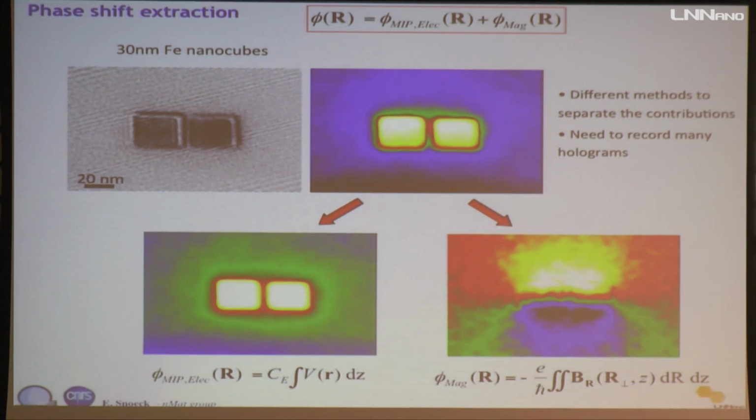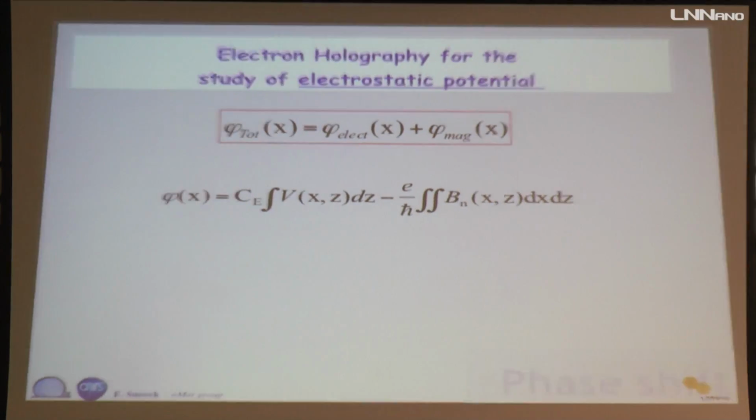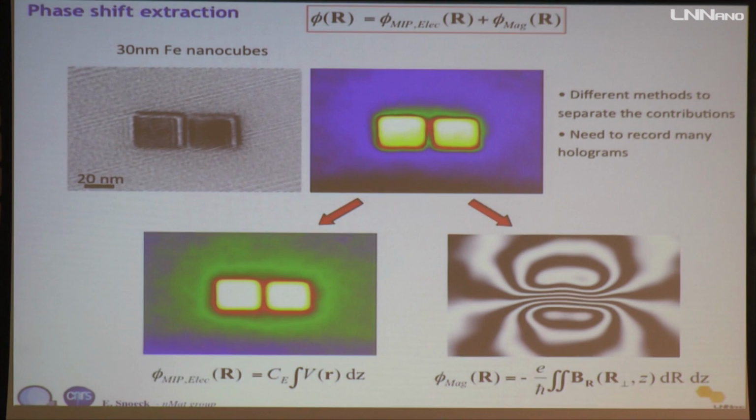But today, during the end of this lecture, I will focus first on using electron holography to measure electrostatic fields. Just something, you can redraw this looking at the curve. And what you see here is the magnetic flux going out of this little cube. But as I said, magnetism is for tomorrow.